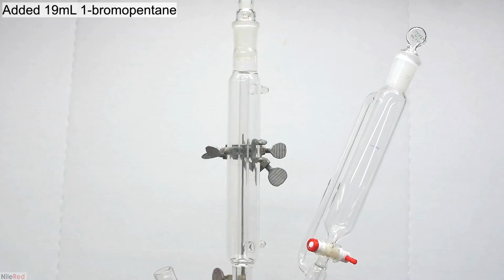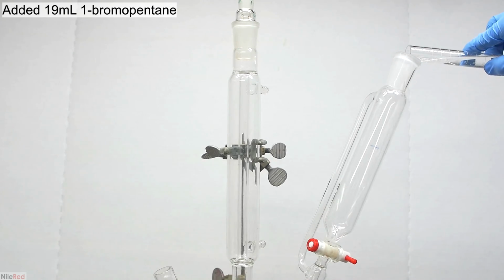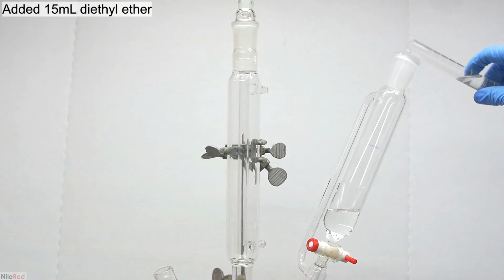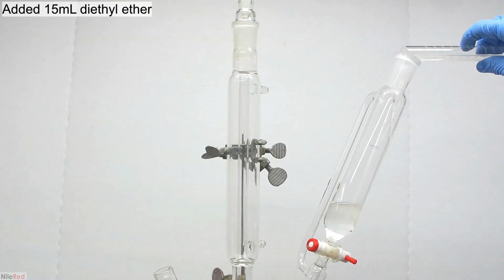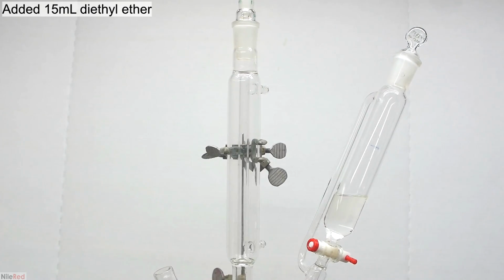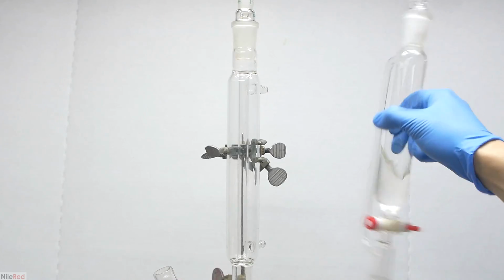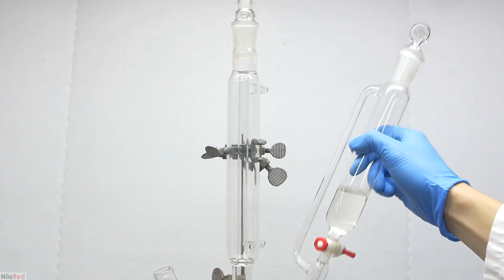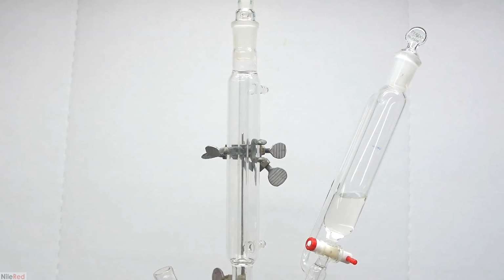Now it's time to load the addition funnel, so I pour in 19 milliliters of 1-bromopentane. The 1-bromopentane in the addition funnel is then diluted with about 15 milliliters of diethyl ether. The addition of this extra diethyl ether dilutes the 1-bromopentane and makes it so the reaction isn't as vigorous. After adding the ether, it's pretty clear that the layers haven't fully mixed, so I take the addition funnel off and shake it around a bit.